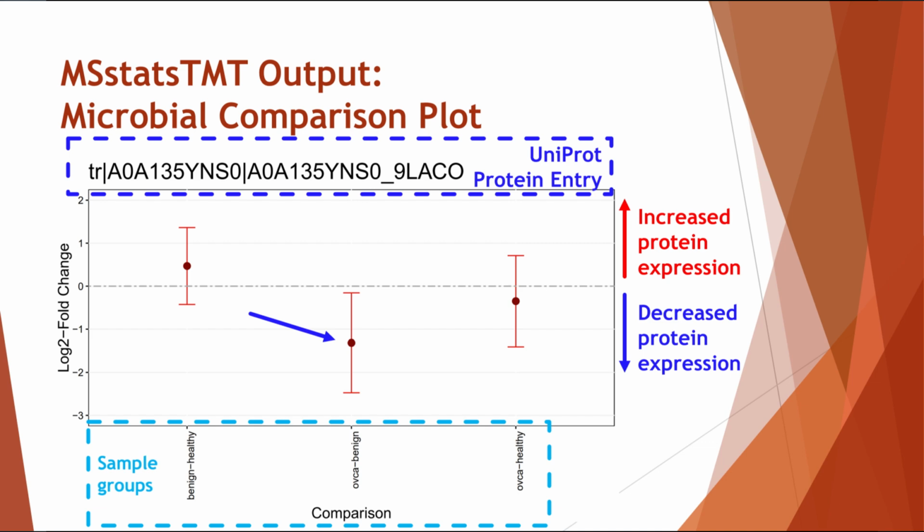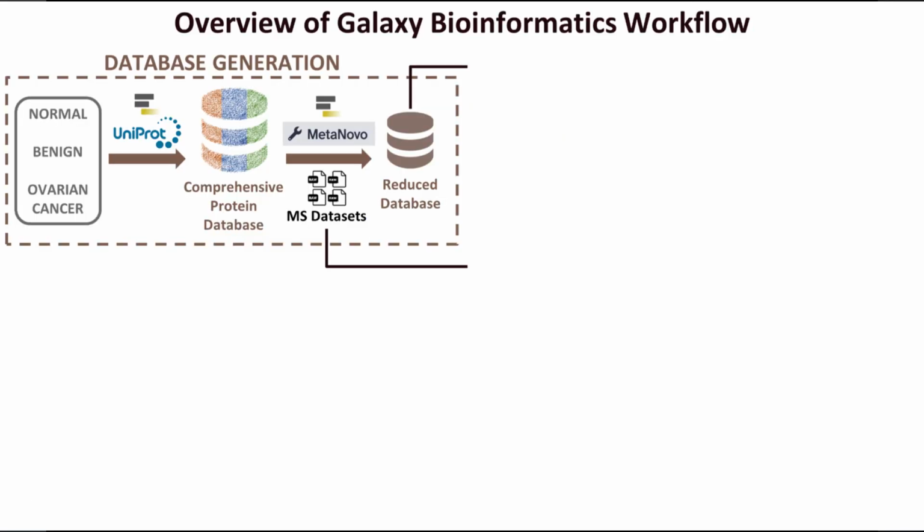This is the end of Module 5. To wrap up this tutorial, let's review the modules one last time to see how much we have accomplished. Starting from the beginning in Module 1 Database Generation, we generated a customized database for clinical metaproteomics that comprised protein sequences from our many species of interest, humans, and contaminants.